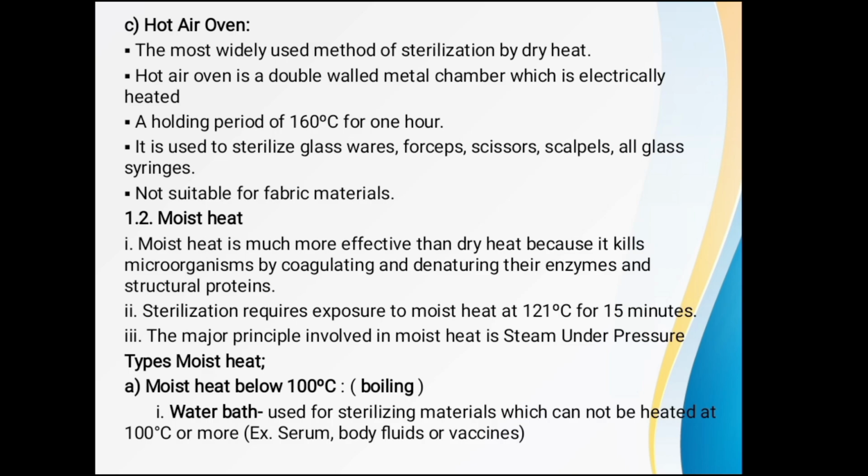Moist heat at below 100 degrees Celsius, moist heat at 100 degrees Celsius, moist heat above 100 degrees Celsius. Moist heat below 100 degrees Celsius for boiling. Water bath used for sterilizing material which cannot be heated at 100 degrees Celsius or more. Example: serum, body fluid, or vaccines.